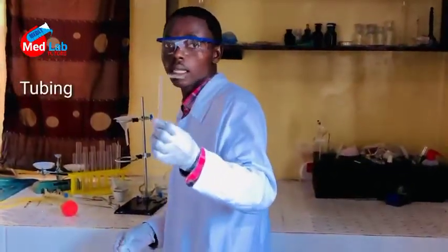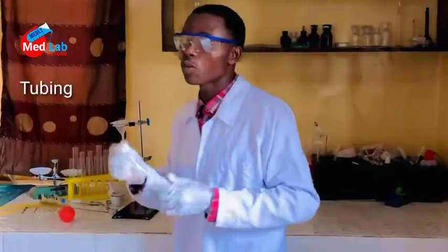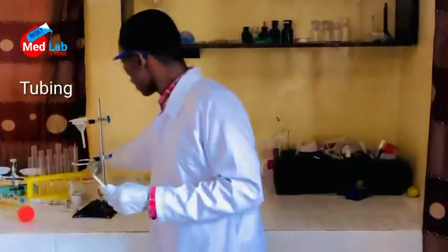Now, we got something in the laboratory setting we call tubing. This can be used as tubing. And the tubing are apparatus that are used to connect flasks together or other apparatus together. In the process of distillation, we will need this tubing. Through the aid of the stopper, we can be able to connect the tubing and the condenser.